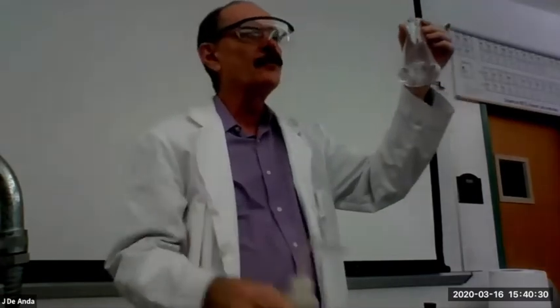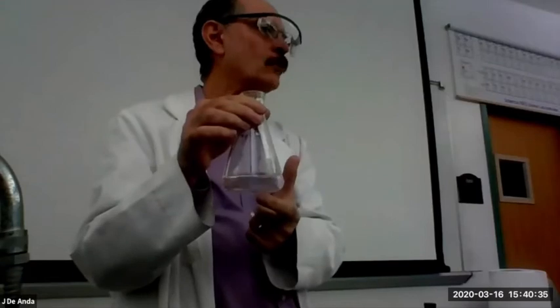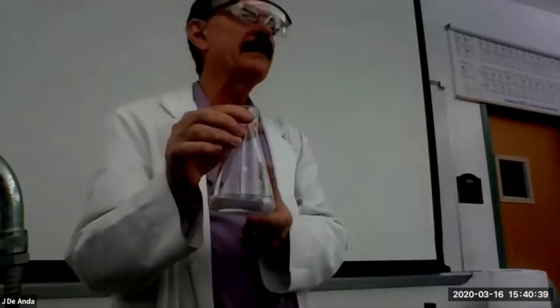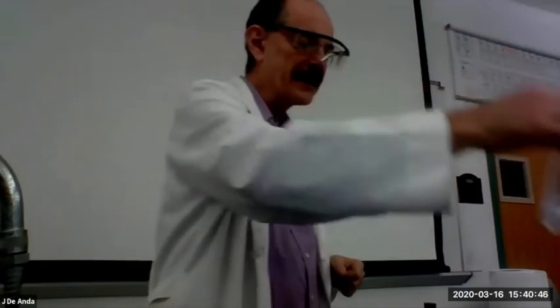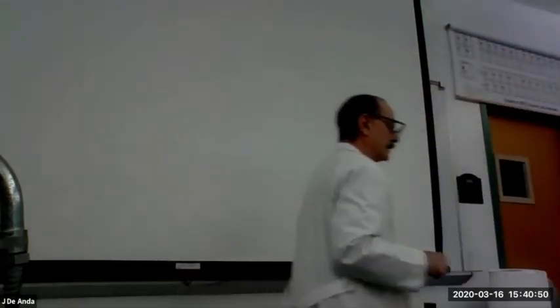Notice that I don't really care how much water is in here. What I care is how much acid was in there. And I get that from the grams that I weighed, which I can convert into moles. Okay. So that is my reaction mixture. All right. And I'm going to put it aside for now. And let me show you what we just did here. Just a review here.